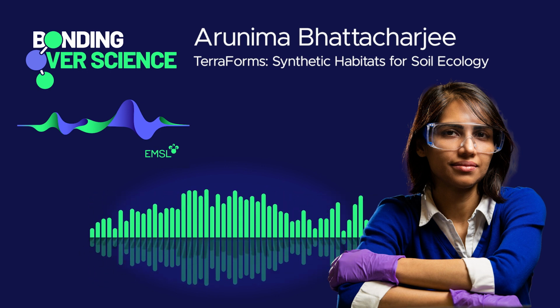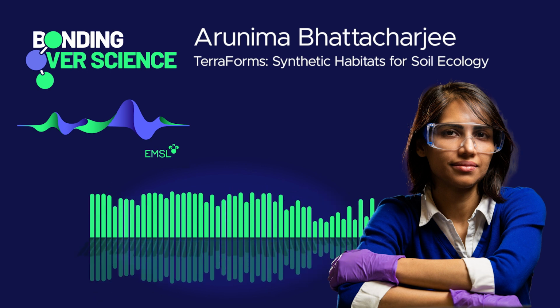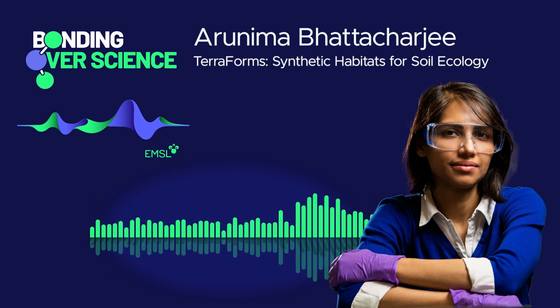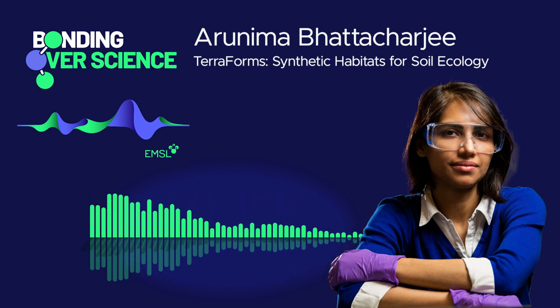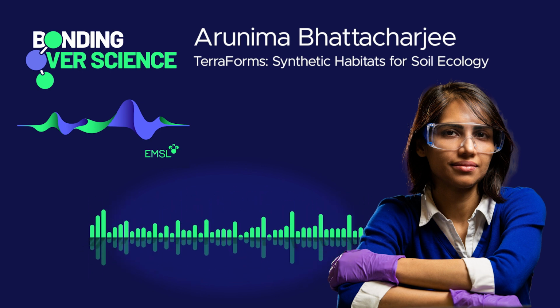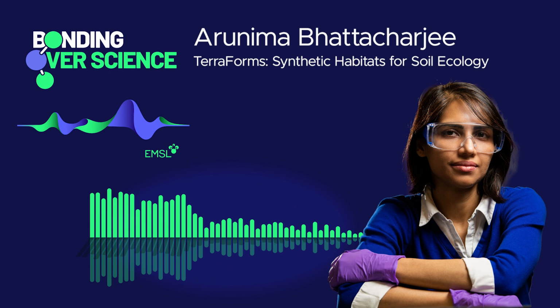If we want to embed minerals, then we typically use different types of polymers to, I guess, simulate the mineralogy that is required for certain projects. All of these devices are then mass spec compatible at the end. And then a seedling is grown from a seed. It is germinated on agar plates. And once it is big enough to be transferred, it is transferred into the chip directly, where it continues growing.